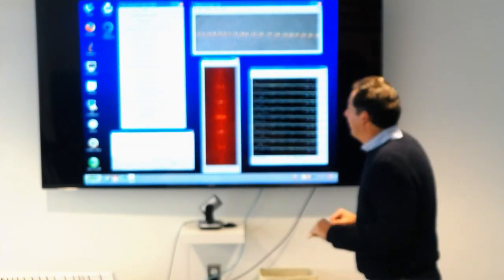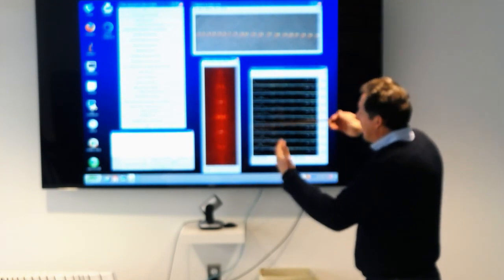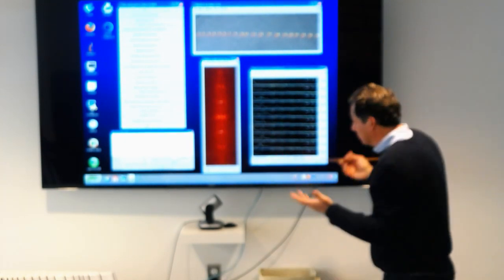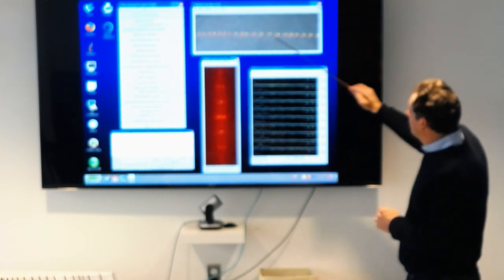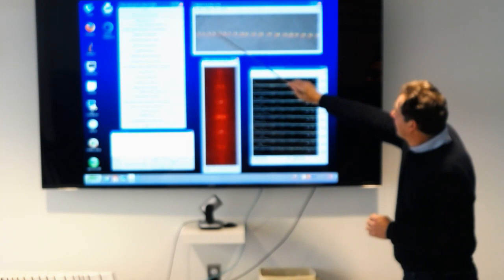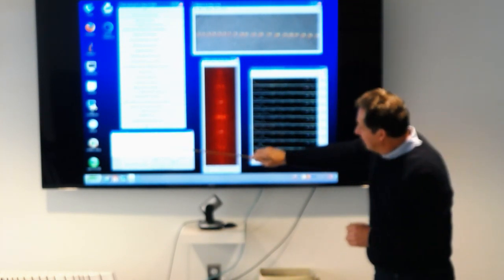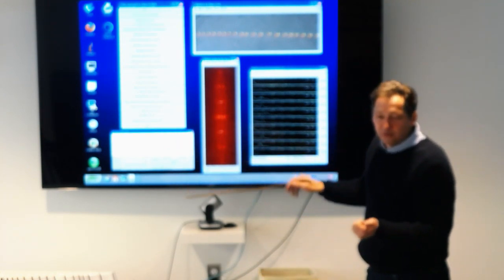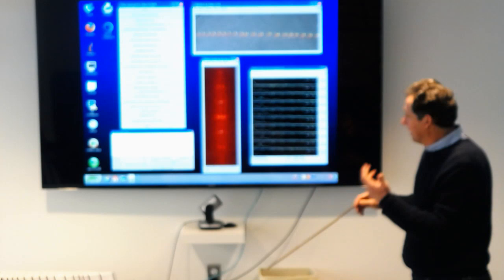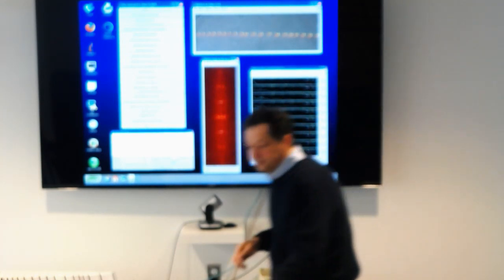So this was an actual example of the software that we used to do it that way. This is the diffraction pattern. This is a microtubule filament. We are marking the position along the axis. That will get straightened. There was a step somewhere in the process to correct for the CTF, like in any other programs and so on.